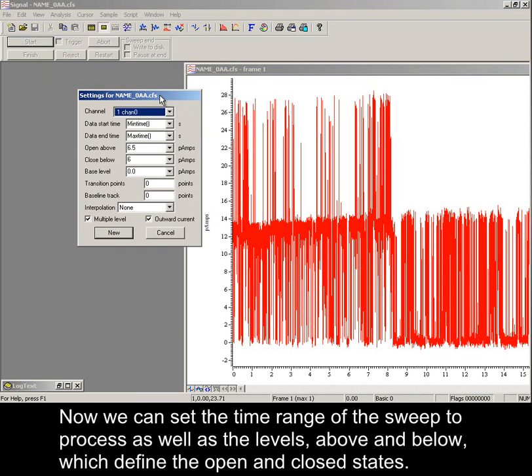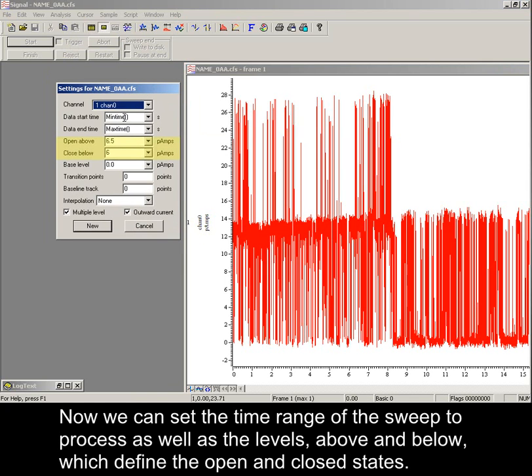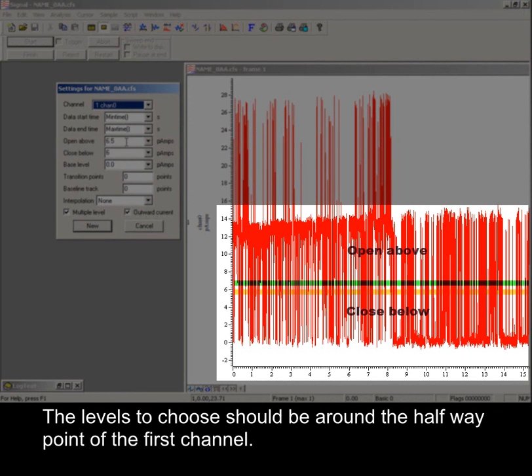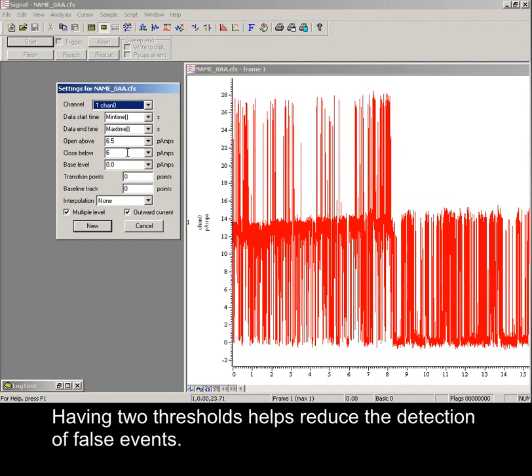Now we can set the time range of the sweep to process, as well as the levels above and below which define the open and closed states. The levels to choose should be around the halfway point of the first channel. Having two thresholds helps reduce the detection of false events.